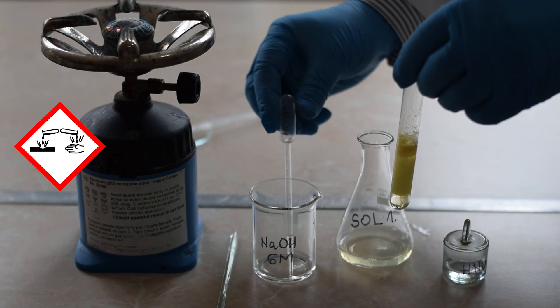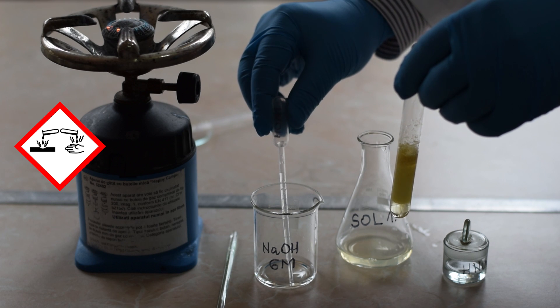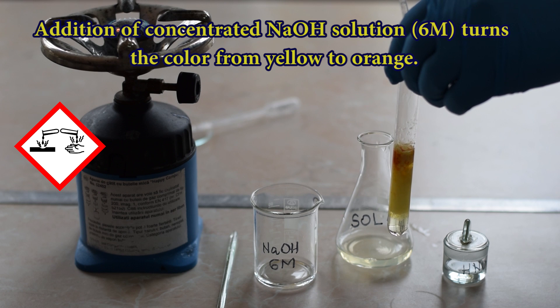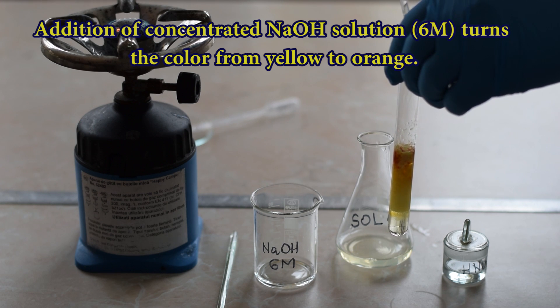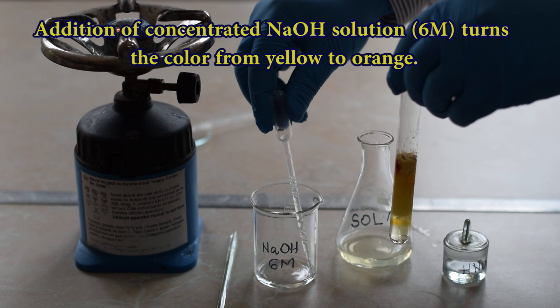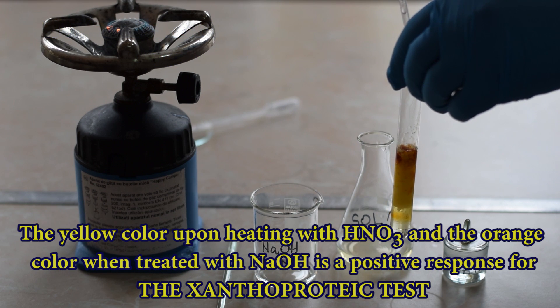Add 1 ml of 6 molar sodium hydroxide. Observe the orange ring that appeared. This is a positive test for the Xanthoproteic reaction.